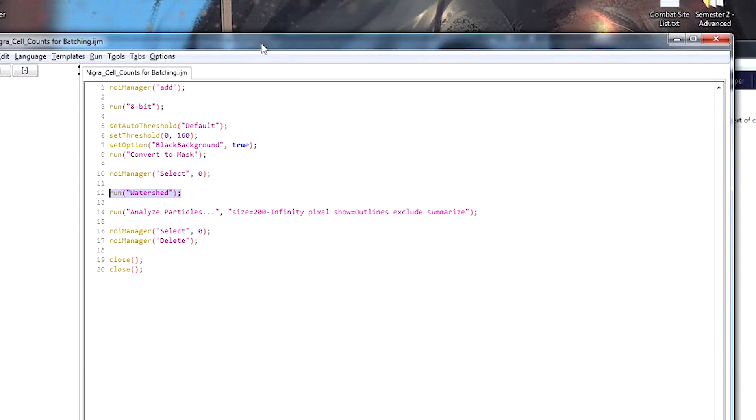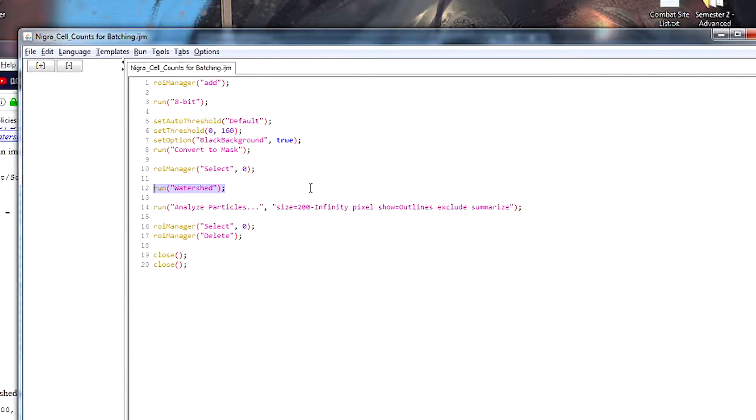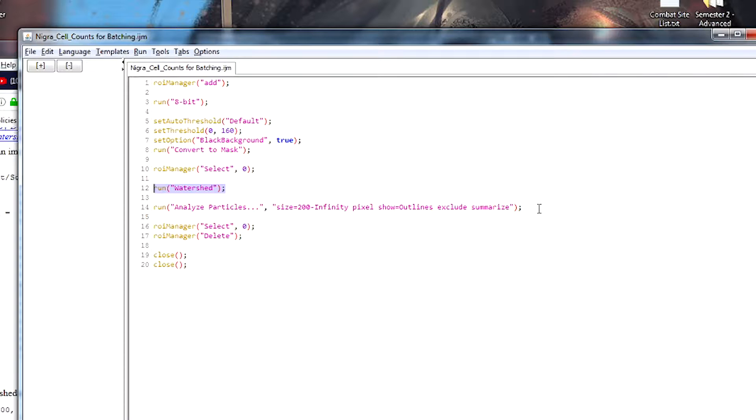Now, once watershedding has drawn a line around all of our positive cells or the cells that are above our threshold level that we've selected, we then need to analyze all of those particles that have been generated or that have been selected. And so that's what this next line does.